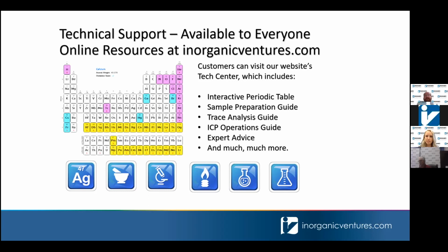I'm looking at my mass spec lines table. I think 118 usually works just fine. It's got 24% abundance. It's only a little bit lower than the 120. I would trust the 118 a little bit more because the only things around it are other tin isotopes. The 120, like Autumn pointed out, has a tellurium interference, so that's an isobaric one. So if you have any tellurium, 120 is not going to be usable. But yeah, 117, 118, and 119 should match each other most of the time.